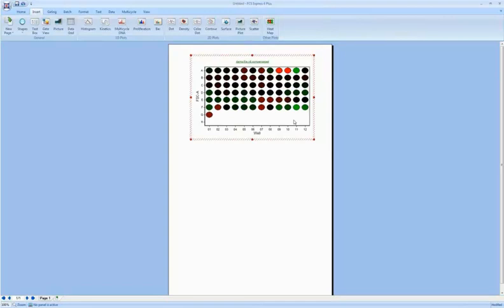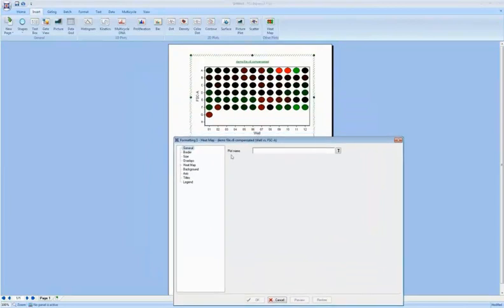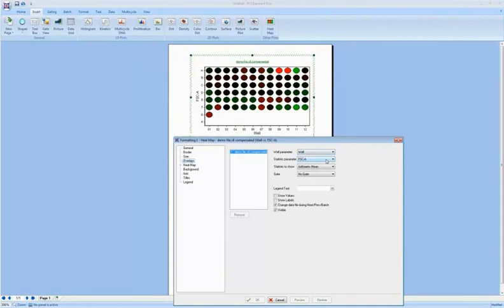So the questions that you'd have when looking at this are, what are these colors based on? You can see that we're showing the well parameter, and we're showing a statistic to generate these colors from forward scatter. Okay, and if I format the plot, we'll show you more information about what that is. So if I go to the Overlays tab, you can see that there are two parameters for the heat map. There's the well parameter and the statistic parameter. And here we're showing the arithmetic mean statistic. Now this could be anything.